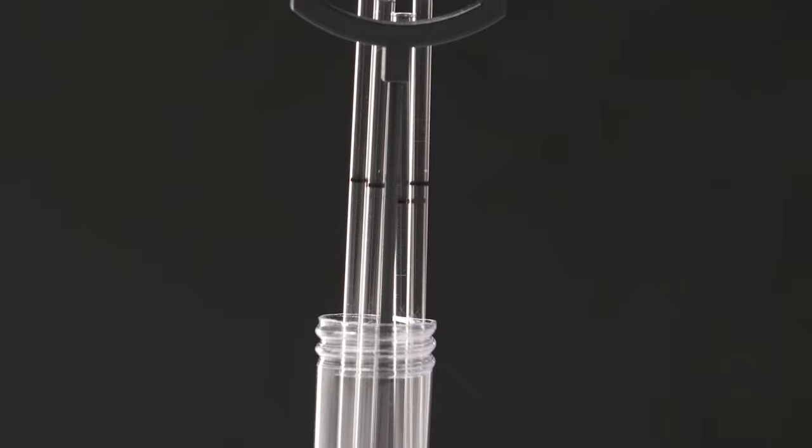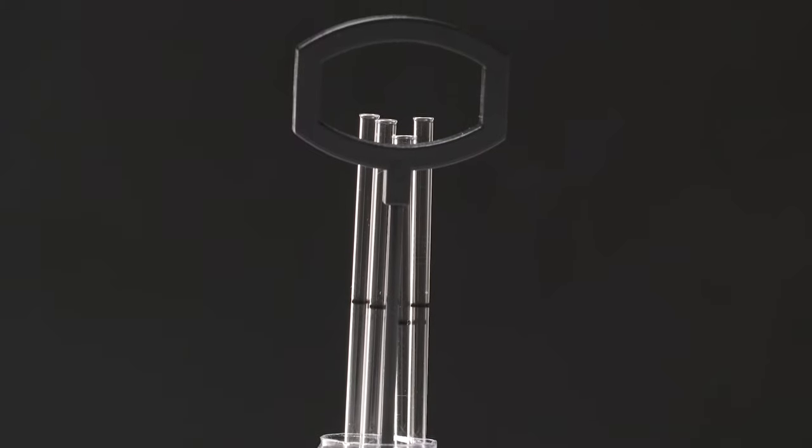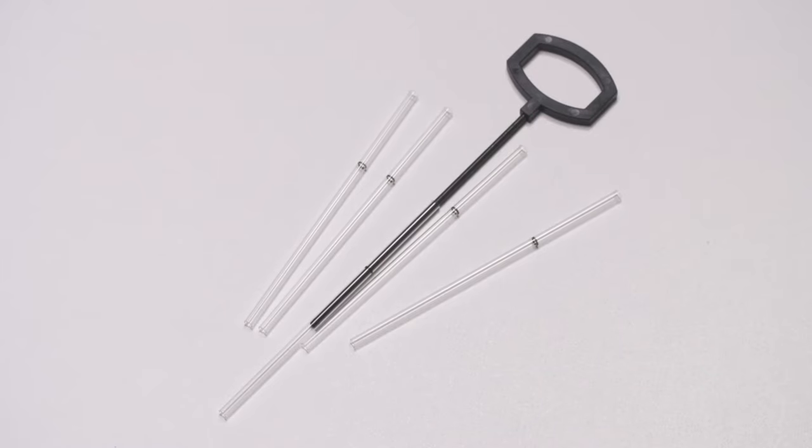The latest innovation in Drummond's point-of-care lineup. The WireTroll 3 replaces the traditional metal wire plunger with a new durable plastic version resistant to bending and deforming.